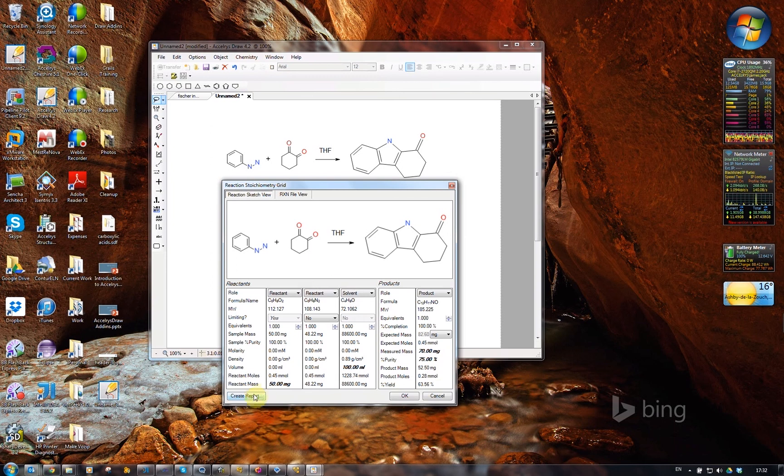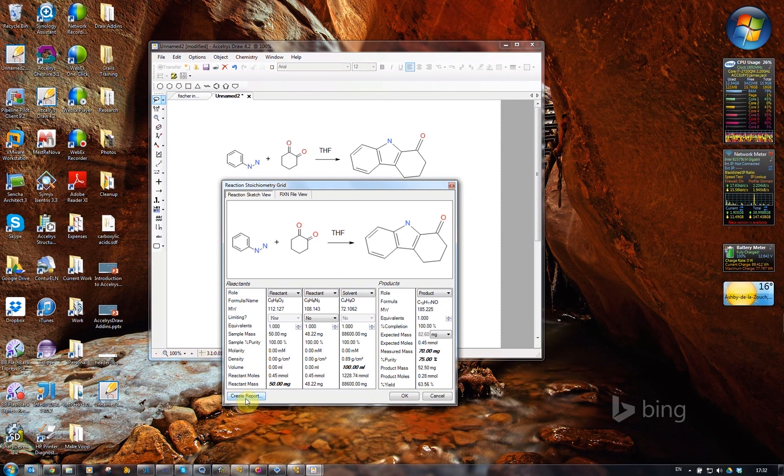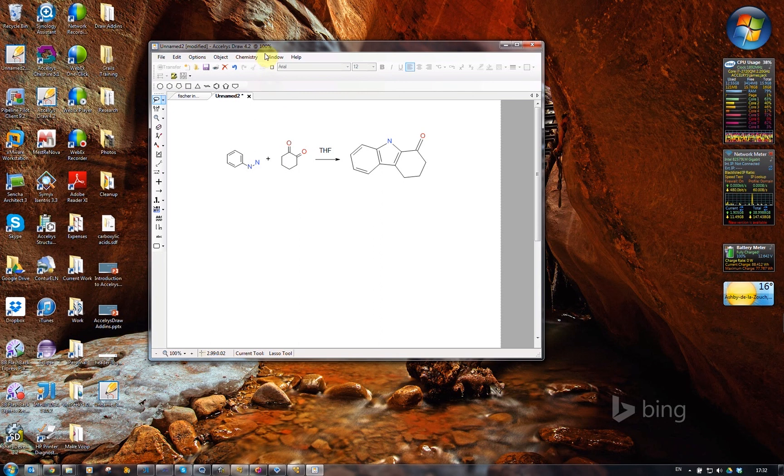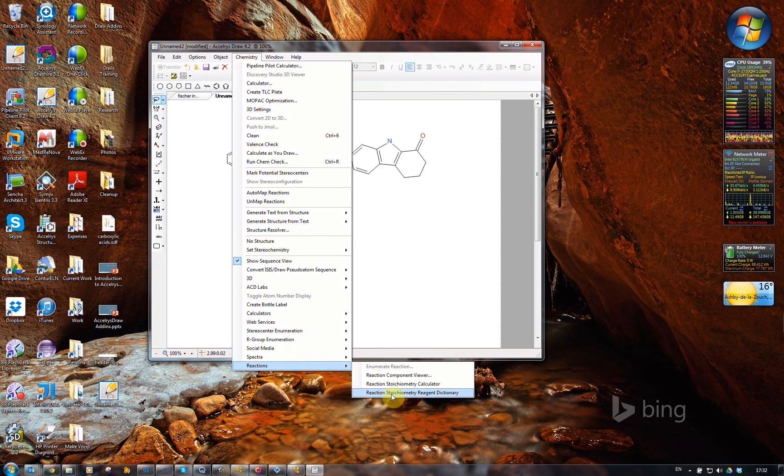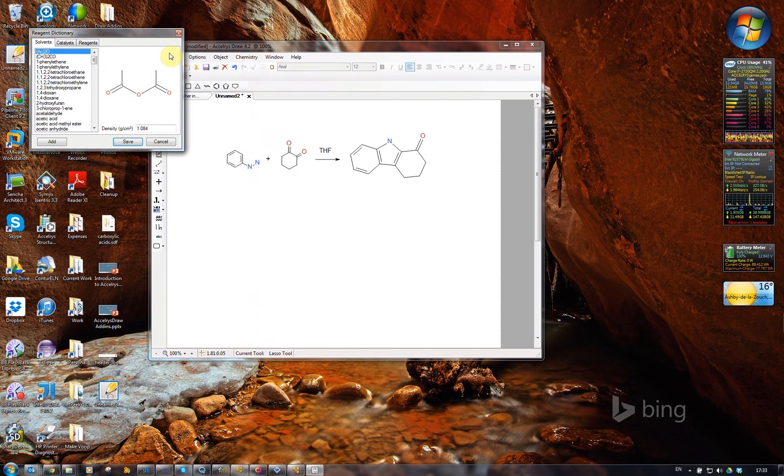You can create a report in here as well. Those are the three add-ins that are available for working with reactions. I'll very quickly show you the dictionary that's using in the background, the reaction stoichiometry reagent dictionary.